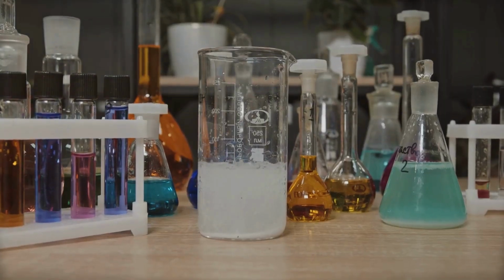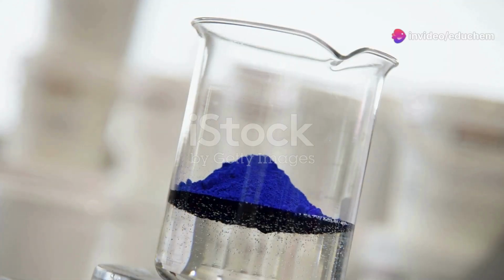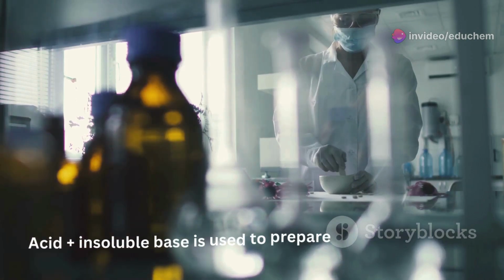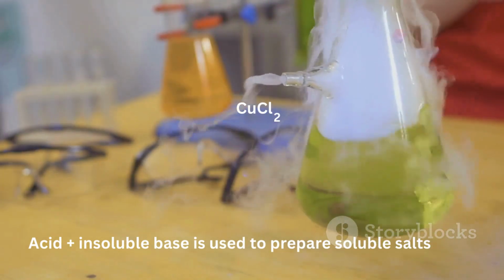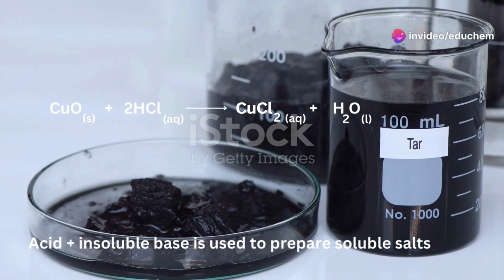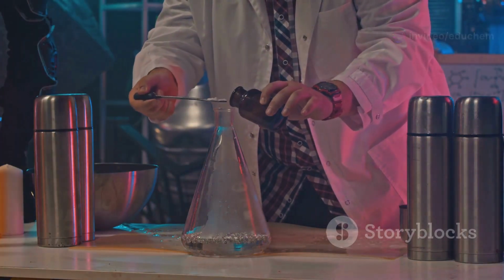Preparation of salts by reaction of acid with insoluble base. Reacting an acid with an insoluble base also produces a salt along with water. This method is useful for preparing soluble salts of weak acids or bases. For instance, when preparing copper(II) chloride, we can react copper(II) oxide with hydrochloric acid, which forms copper(II) chloride and water. The method is as follows.